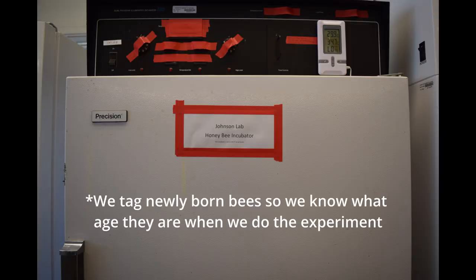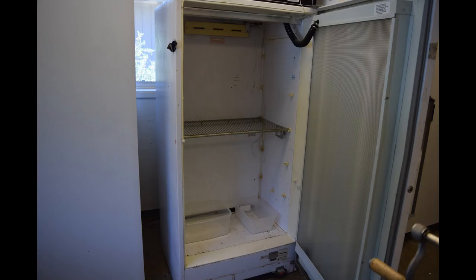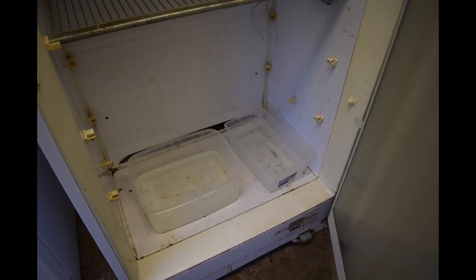A big part of tagging newly emerged bees is having a place for them to emerge, and that's what an incubator is for. The first thing I had to do is go check our incubator and make sure it was running at the right temperature and humidity. We maintain humidity by keeping containers of water in it at all times — and that's when I opened it and realized those containers hadn't been filled in a year.